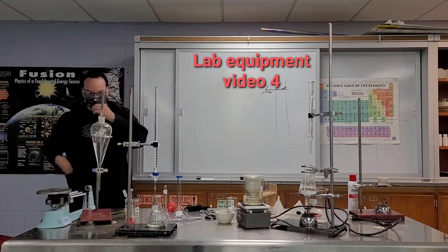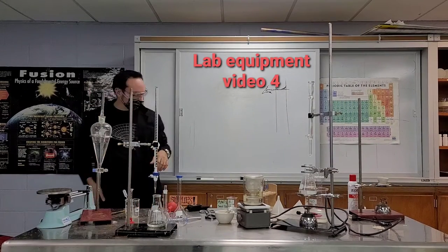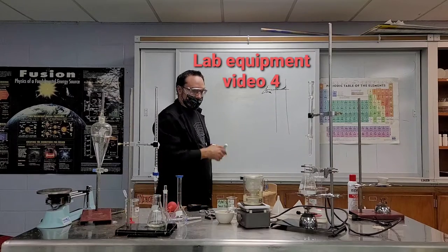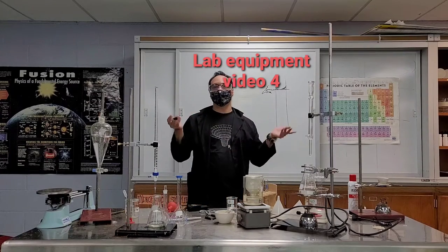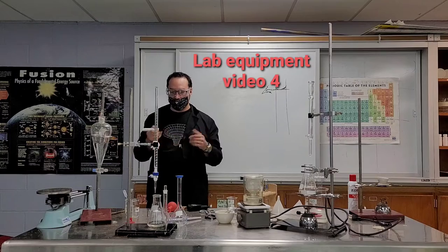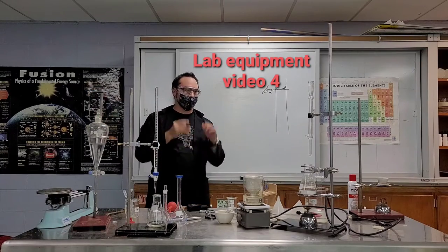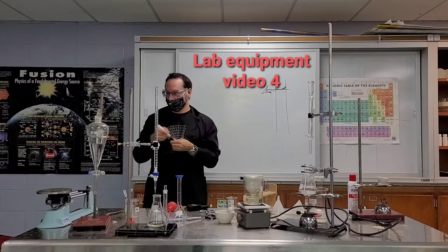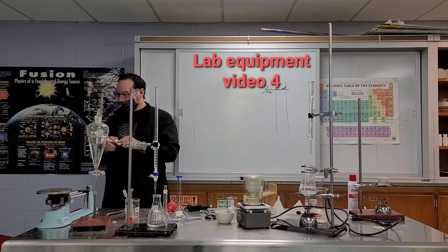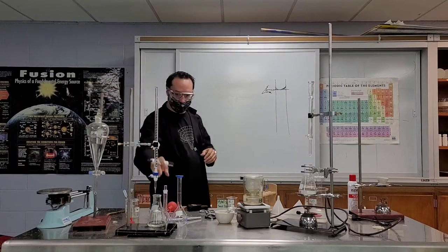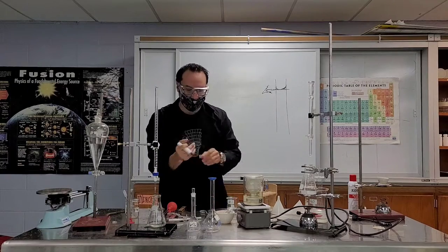Almost done looking at some basic equipment. Let's keep it moving, but just to let you know there's even more equipment I'm not going to get to in this video. As we come across some other pieces of equipment in laboratories, I will teach you about them. All right, what we are up to are these guys.